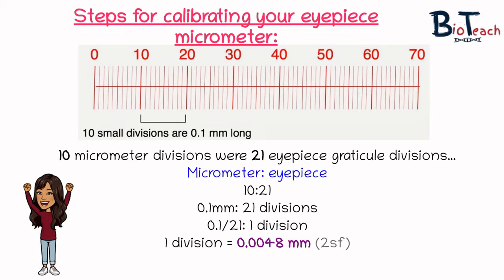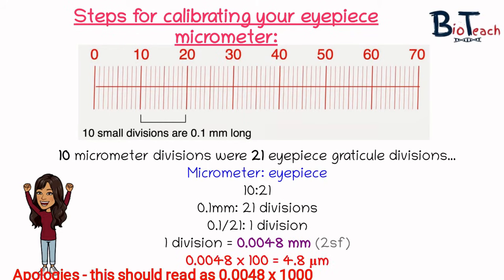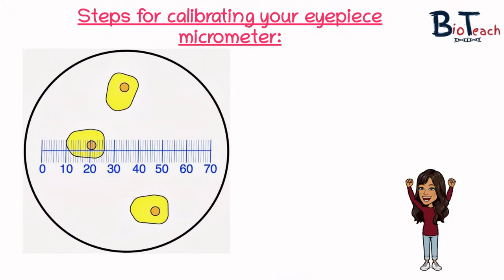We don't want to work with these inconvenient decimal places, so we can convert to micrometers by multiplying by 1,000 — so 0.0048 becomes 4.8 micrometers. Essentially, each eyepiece graticule division is 4.8 micrometers. We're now in a position to measure the sample at this magnification. You can measure your specimen using the eyepiece graticule and convert the number of divisions counted to an actual length.